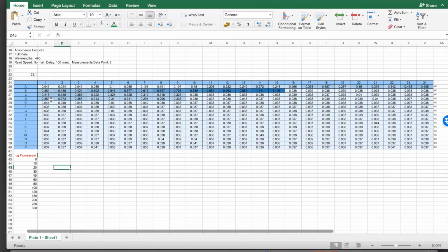But I do have reference samples, which I call the standards, and they mean something. I know how bright they need to be in order to indicate microbial activity. So first I'm going to make a curve, and based on this curve I can calculate the activity of the microbes in our samples, okay?